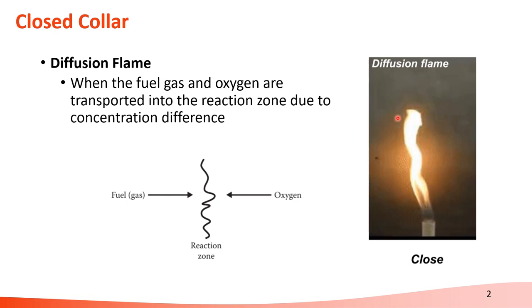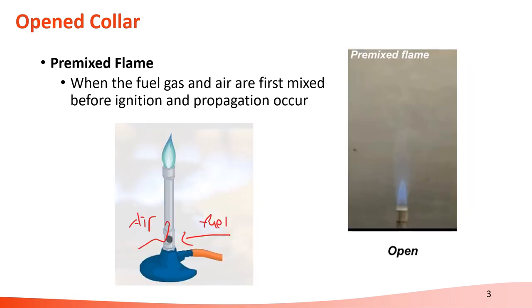So we can see a yellow and shaking yellow flame here. Now, what about when we open the collar? When we open the collar, we will generate a pre-mixed flame.